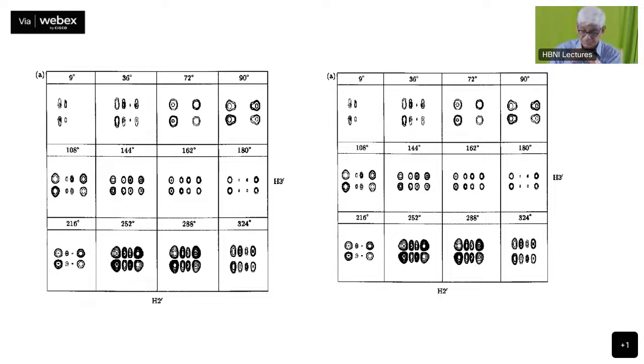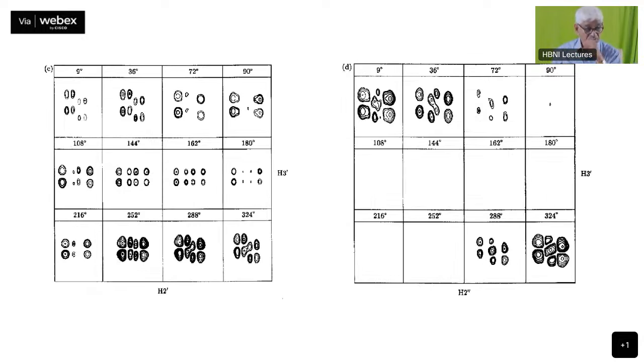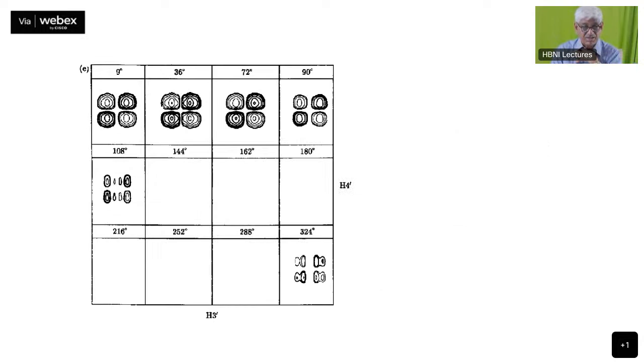Okay, so therefore you can use this to identify the sugar geometry in your molecule at a very high resolution. So this is once more a similar one, except now it is a 45-degree or the E-COSY spectrum. In the E-COSY spectrum also you will have different patterns and you can identify. So this is for record. You have these already published at various places, and you can use this material whenever you analyze the spectrum of a DNA molecule.